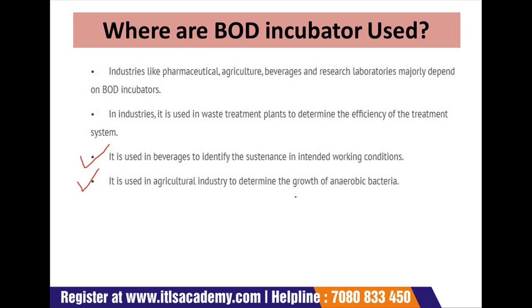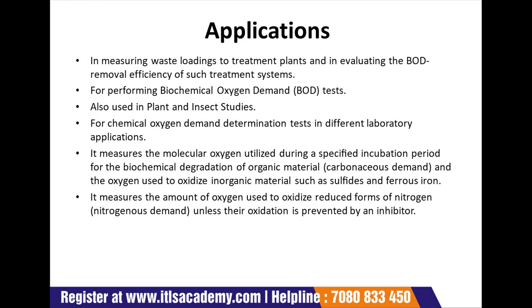Now we will discuss the applications of the BOD: in measuring waste loading to treatment plants, in evaluating the BOD removal efficiency of such treatment systems, and for performing the biochemical oxygen demand test.